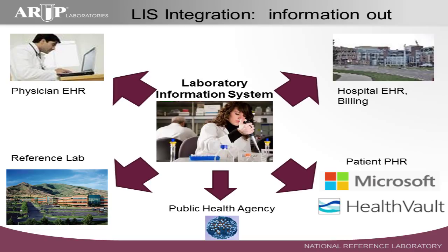You know, labs for years were overwhelmed with paperwork, and assimilating those paper charts and distributing those was a big task. So one of the first areas they tried to automate in the hospital with computer systems was the laboratory. So they've been around for a long time. Laboratory information systems are considered to be mature information systems. Okay? So getting data out of the lab system, where does it typically go?